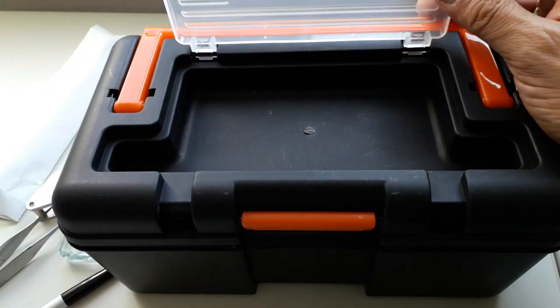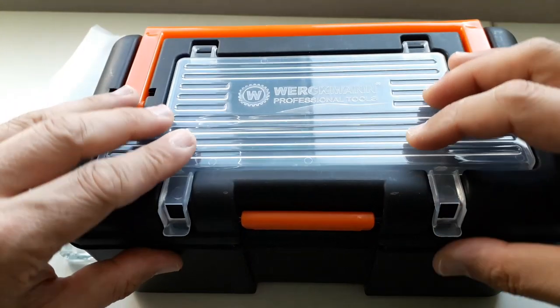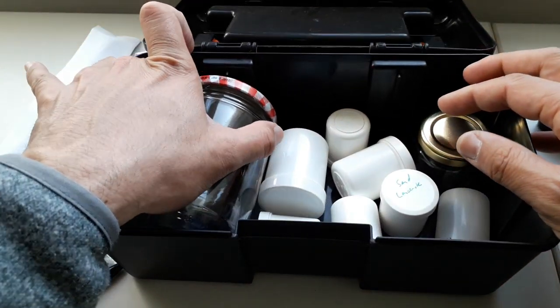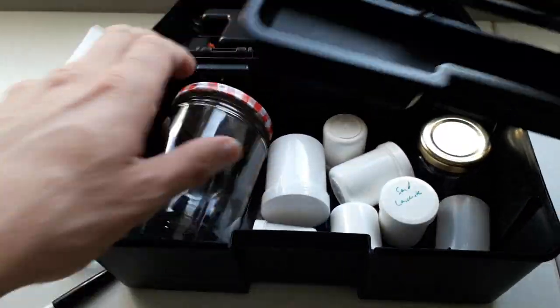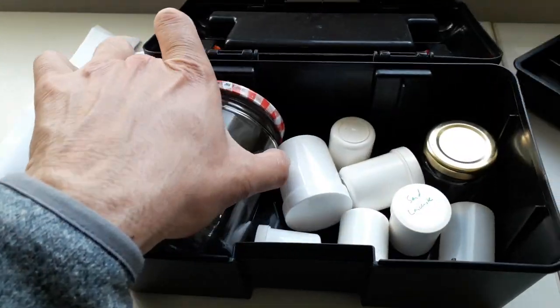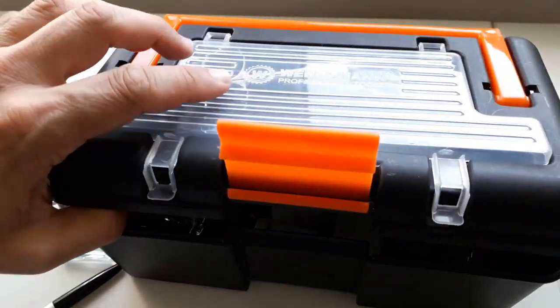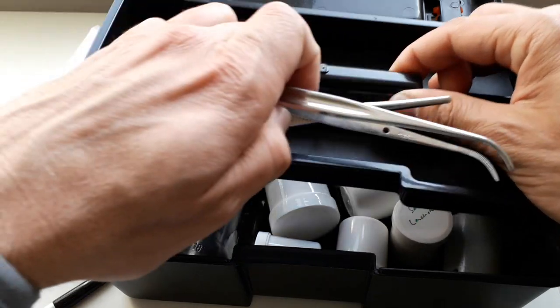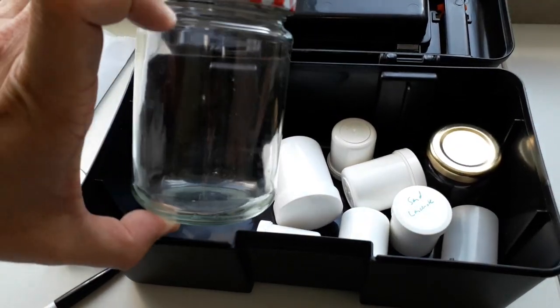So what I usually do is I put some tools in here to take along. I close it up here, and in here I have a whole bunch of specimen containers. Unfortunately, this jar is too large, so I cannot at the same time put this plastic top in here. I just leave this at home because I put the tools into the lid here, and I just keep the tools that I don't take along. I usually keep them in here. So that is basically for collecting water samples.